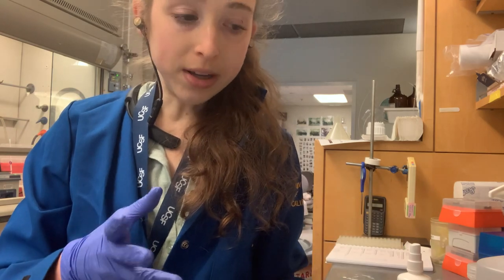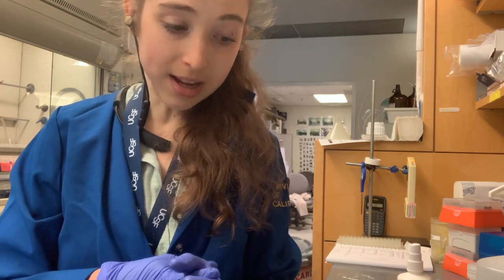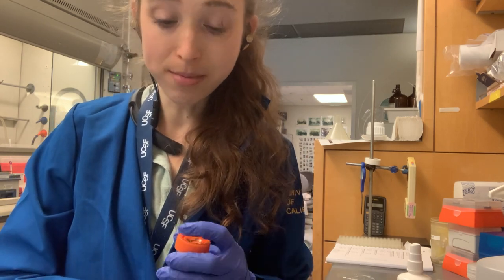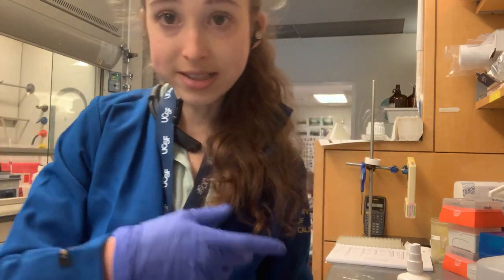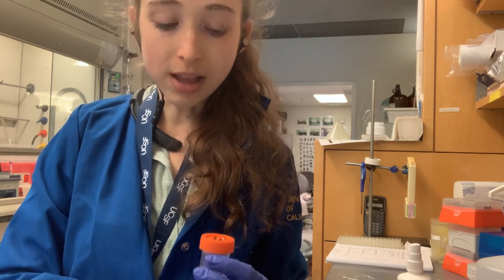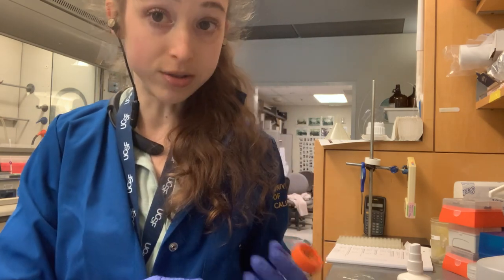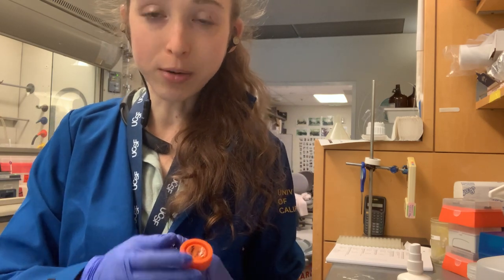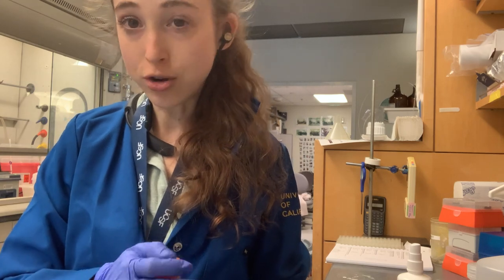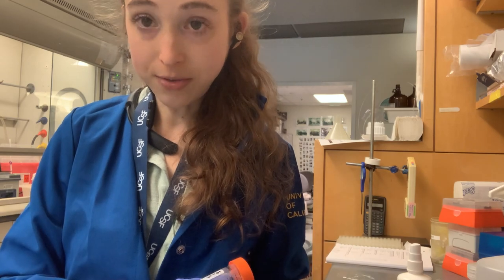You always want to label, but you don't always need to label as thoroughly as other times. If something's going for long-term storage, like a protein expression pellet, there's no way you're going to remember two years from now exactly what you did on that date. So it's important that you put a lot of details that will allow you to reference back to your detailed notes.